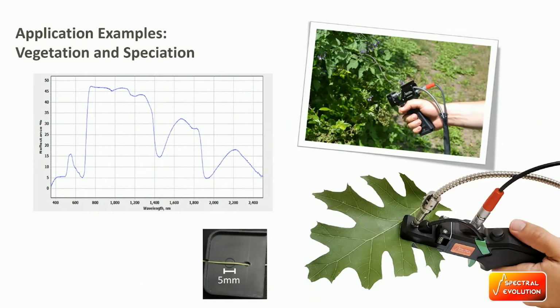Another incredibly common measurement is in leaf reflectance measurements. This is typically conducted with the leaf clip or a pistol grip. Again, the bare fiber or lens will give you a greater average of the plant's reflectance, and the probe allows you to be more targeted. So the leaf clip's design takes the light away from the source or the target material in order to minimize any damage that the heat of the light source would do to that leaf.